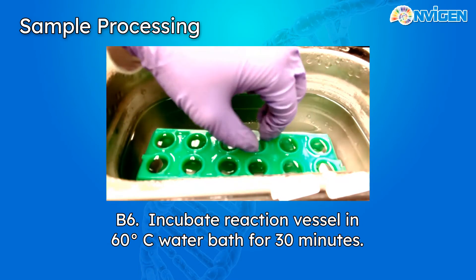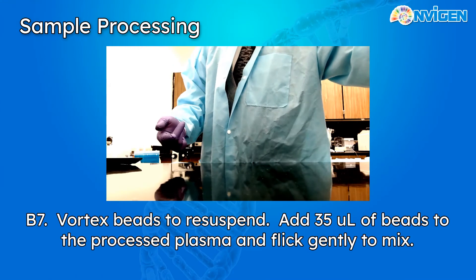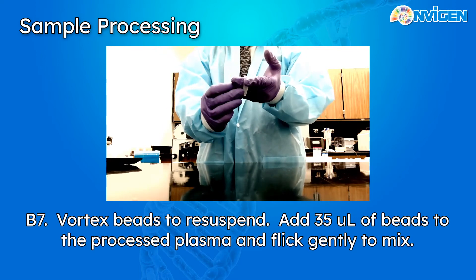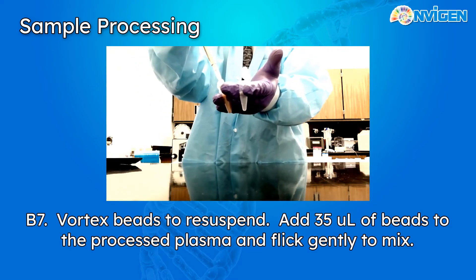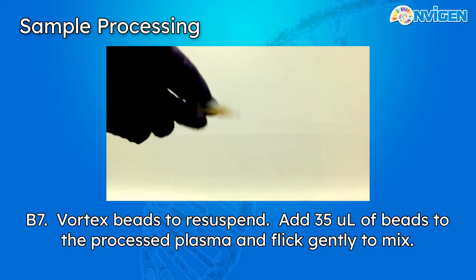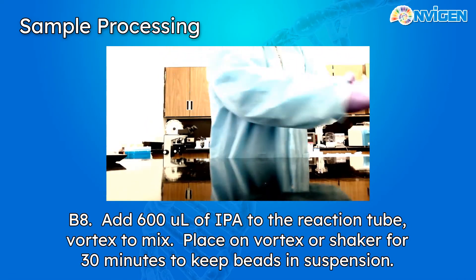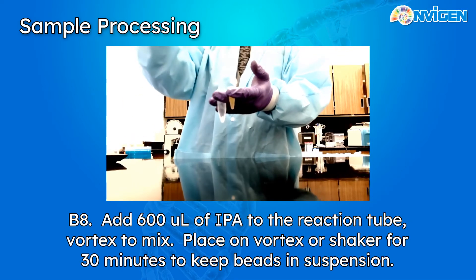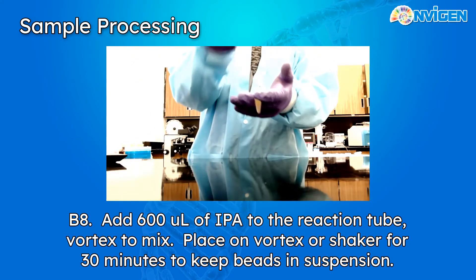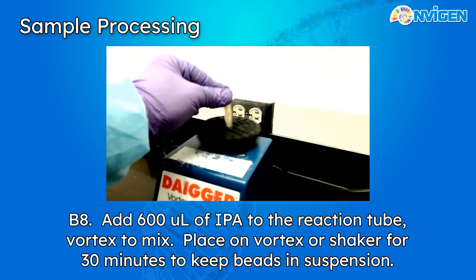Once the 30 minutes are done, take it out. The plasma sample has been processed and is now ready to be incubated with the beads. Vortex the beads thoroughly to resuspend them, then pop open your tubes and add 35 microliters of beads to the processed plasma. Give the beads a few flicks to resuspend them somewhat. Now add 600 microliters of 100% isopropyl alcohol to precipitate the CFDNA onto the beads. Pop your tube closed and give it a quick vortex before placing the tube into a dedicated shaker for 45 minutes to keep the beads suspended in solution.